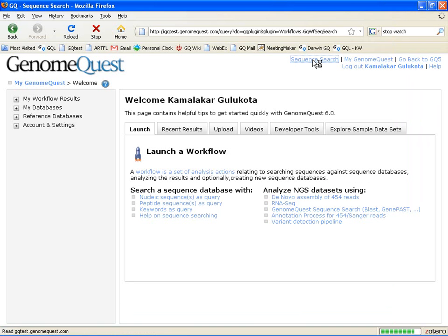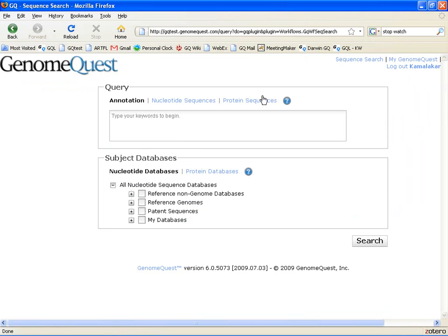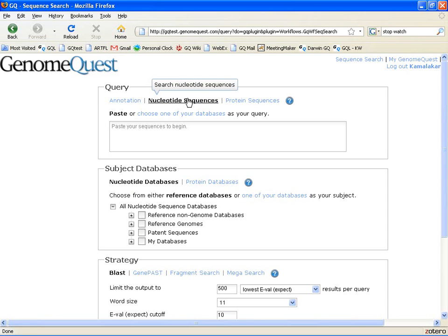Once you reach the sequence search page, there are three simple steps. The first is to specify your query. In our case, it's nucleotide sequences.